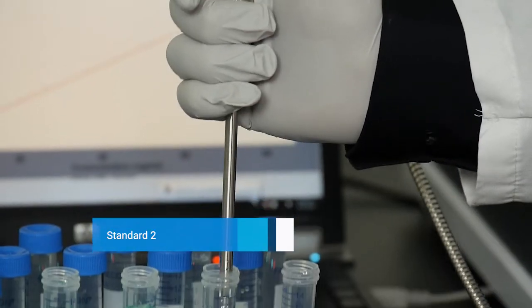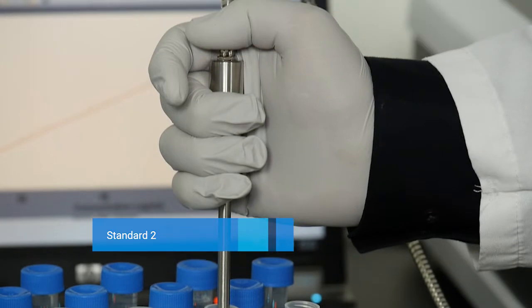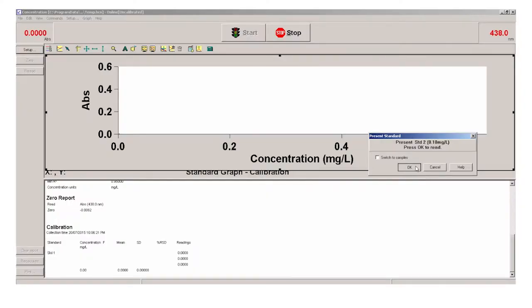Now we come back and we run the second low standard. And again, press the button and take a measurement.